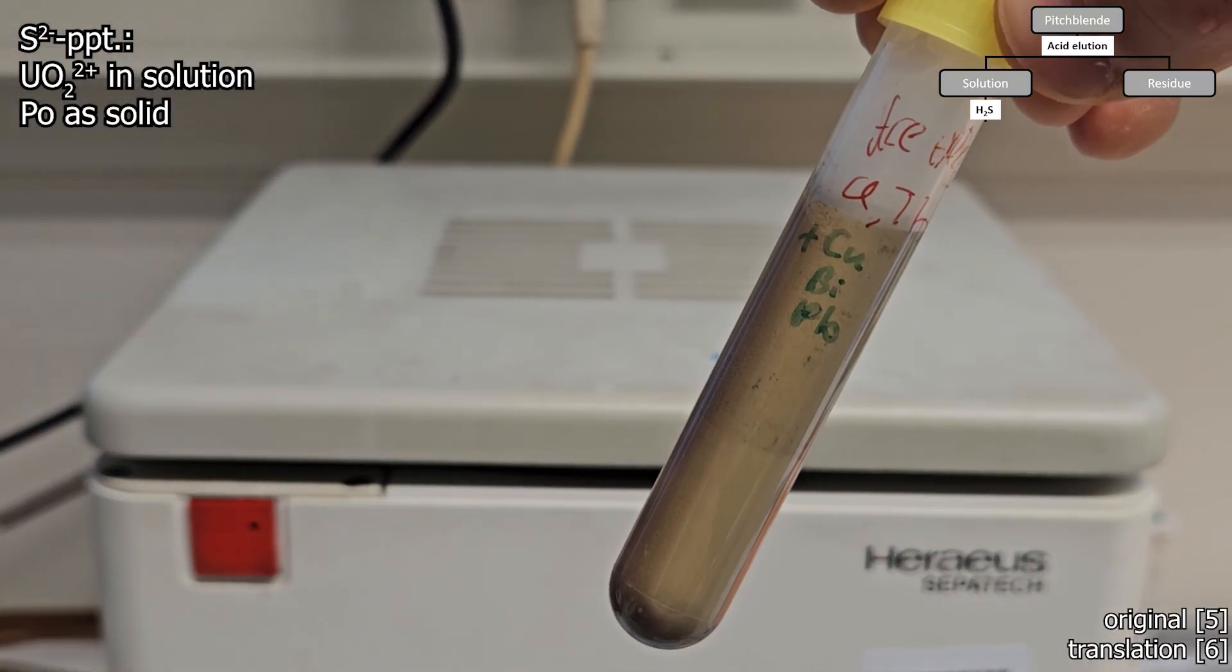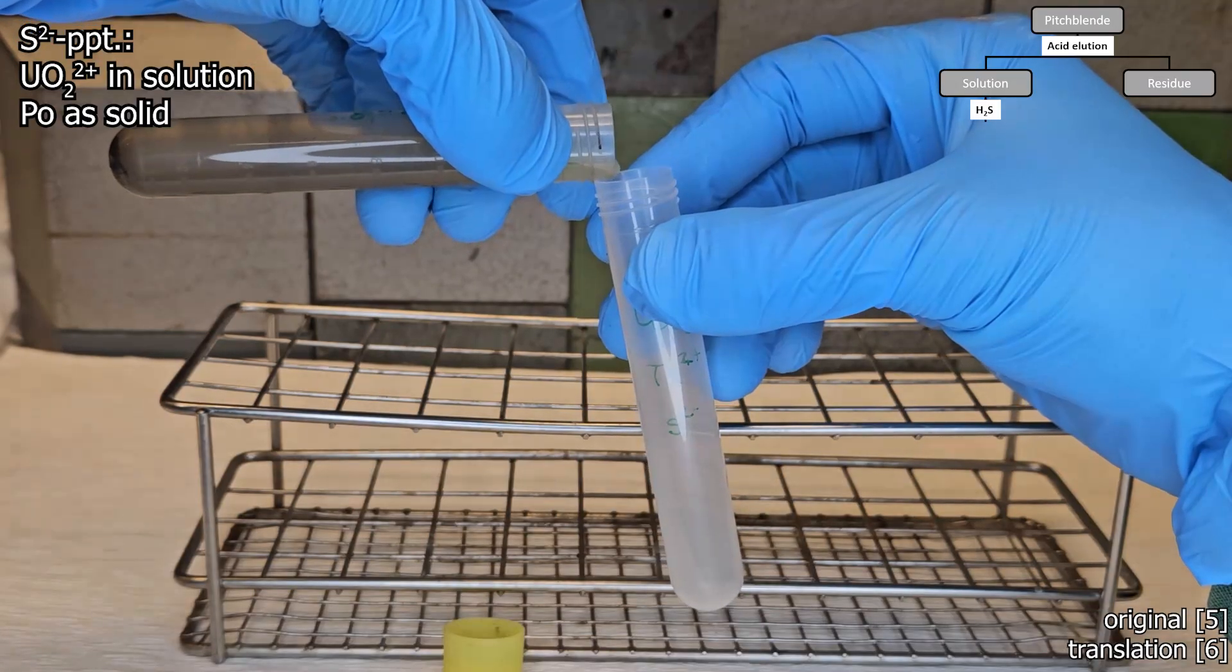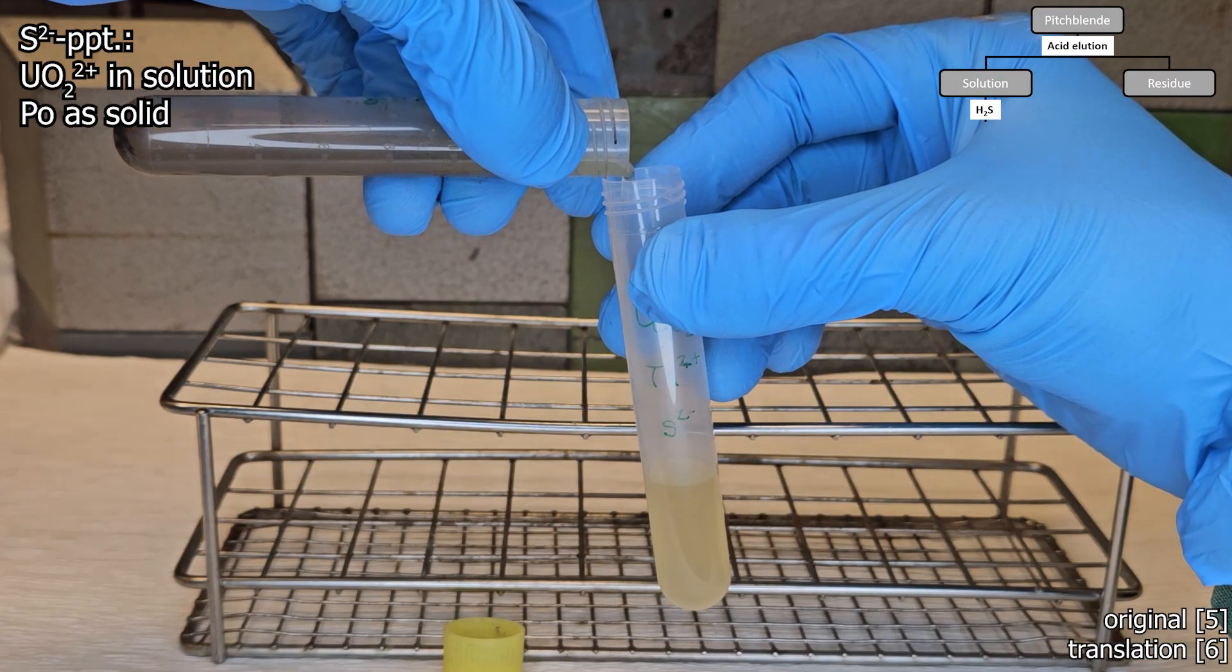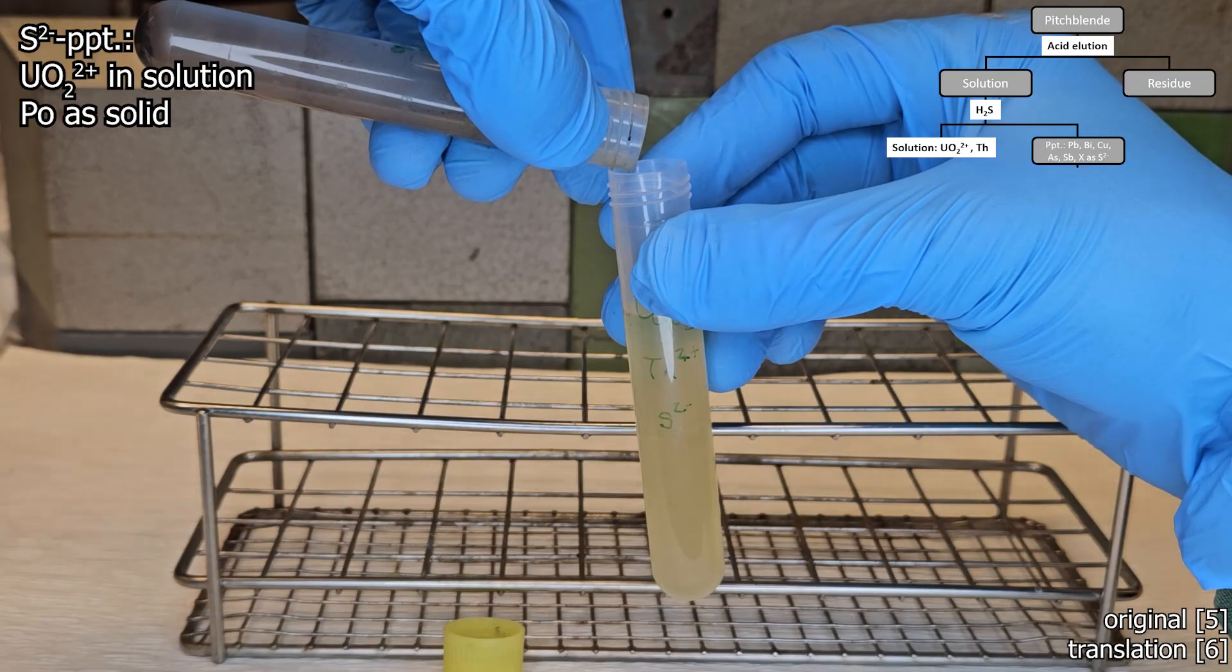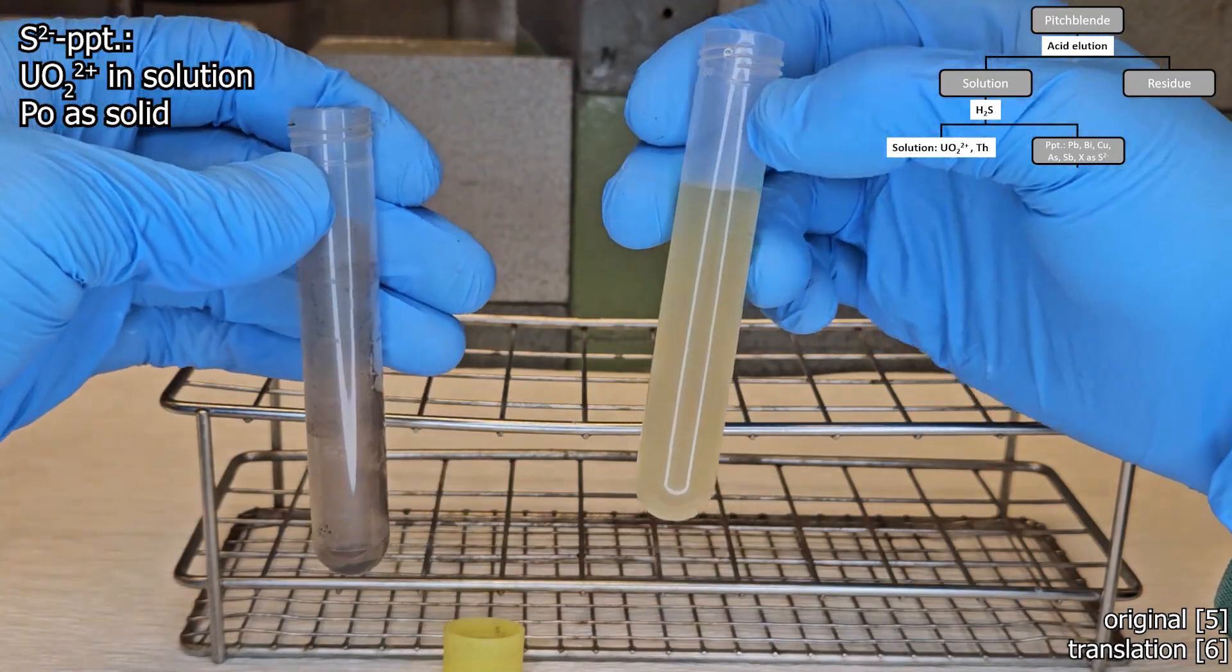That was really annoying as the sulfide is really fine and sticks to pretty much everything. You can track the procedure because at the end you want to have a clear yellow solution. The yellow color comes from uranium and there's also some thorium present, which remain in the solution.